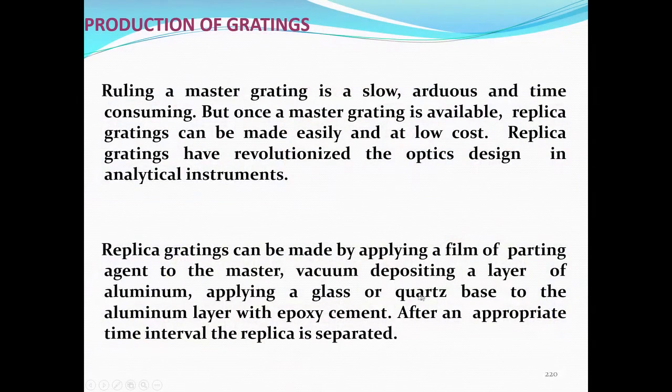A glass or quartz base I need to take, and join it to the aluminum layer with epoxy cement. After an appropriate time interval, the replica can be separated. This is a very simple, easy way of producing a grating, which is a very high quality engineering material.